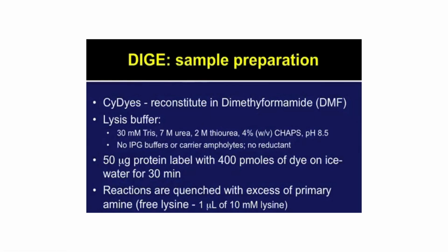No IPG buffers or carrier ampholytes are required; those are required only when you are not doing the DIGE technique.